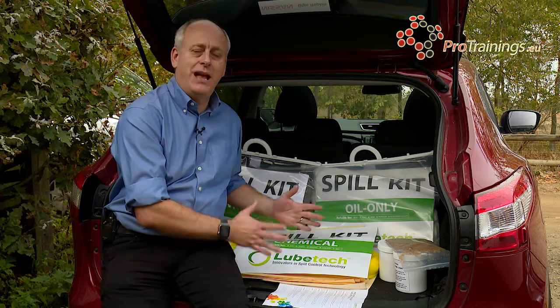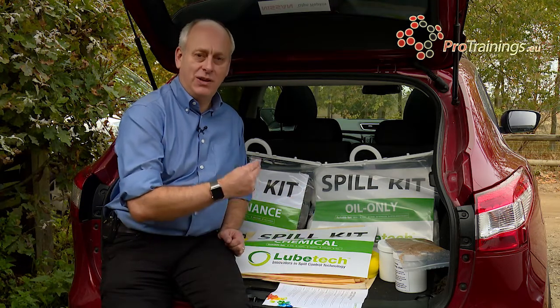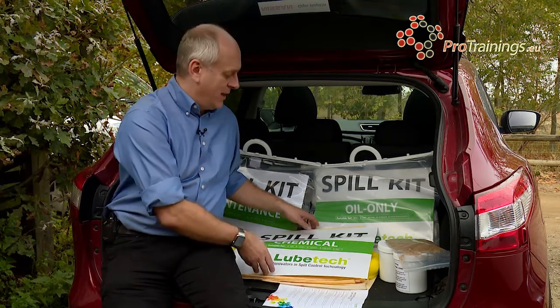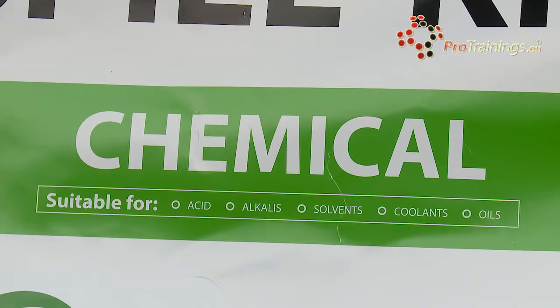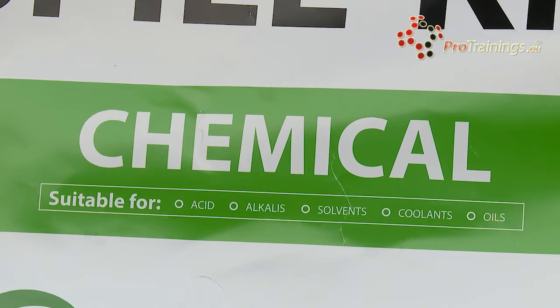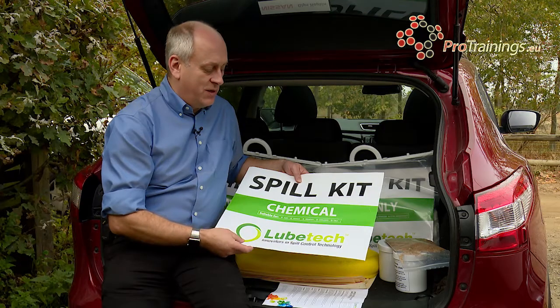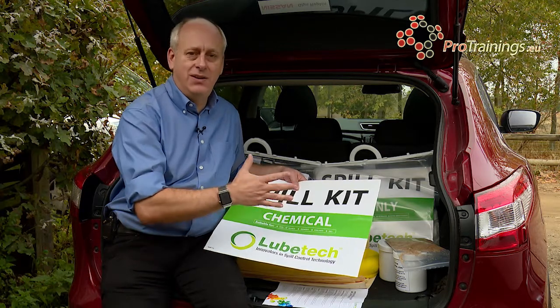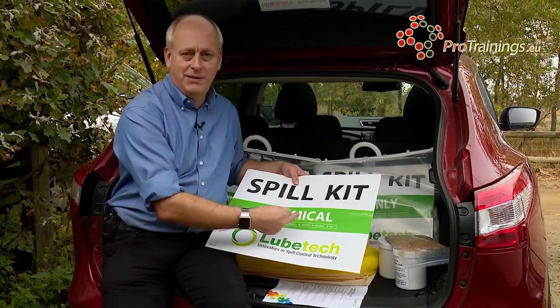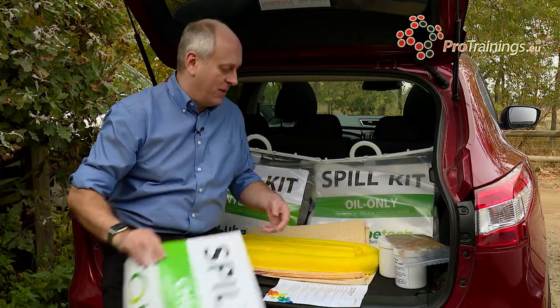It is quite important that if you have a spill kit, you make sure you are using the correct one for the correct job. On the actual display, they all come in these plastic bags. On the main display it will tell you what it is actually suitable for — you can see directly from the cover exactly what the product will do. So just make sure that what load you are carrying or what you have in your workplace, you have the relevant spill kits for that chemical.